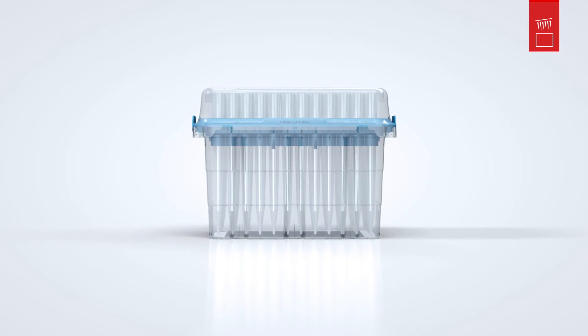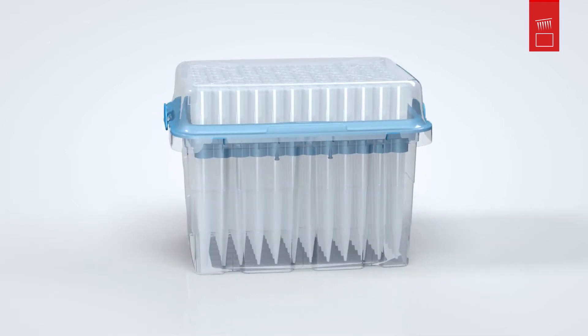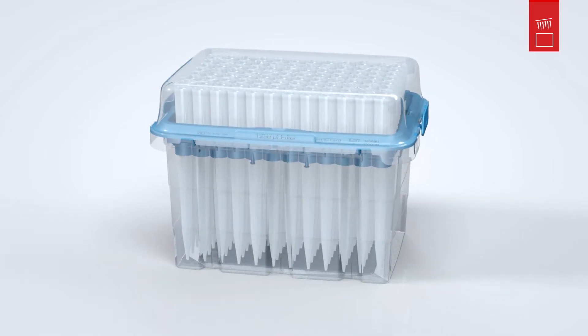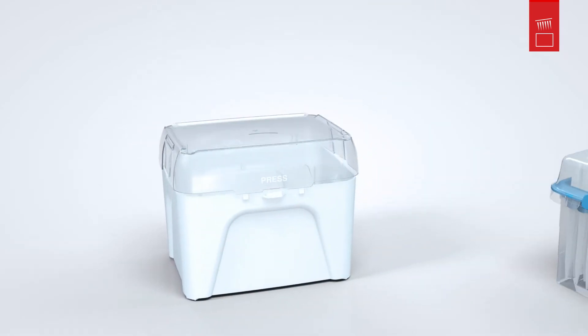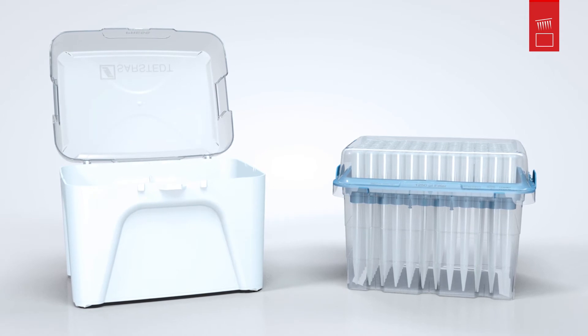Sustainability is a key requirement in today's society. The single refill is the solution for your sustainable laboratory. For the highest level of purity and ecological efficient refilling, all you need is an empty tip box and a new Sarstedt single refill.